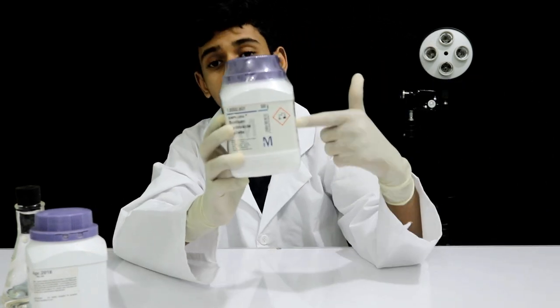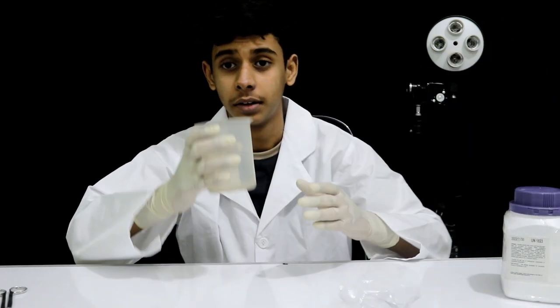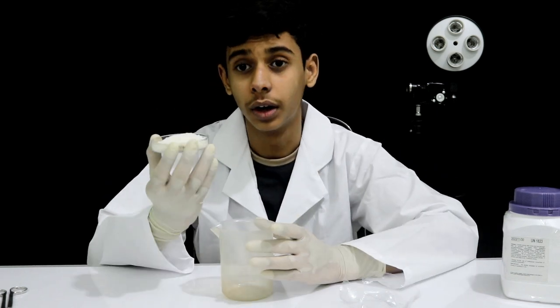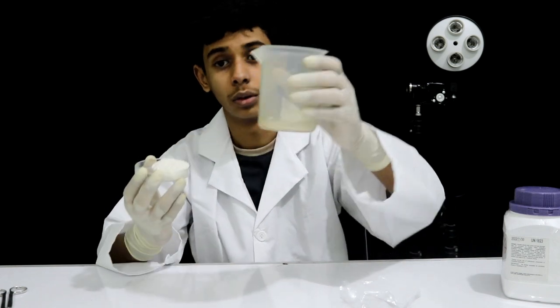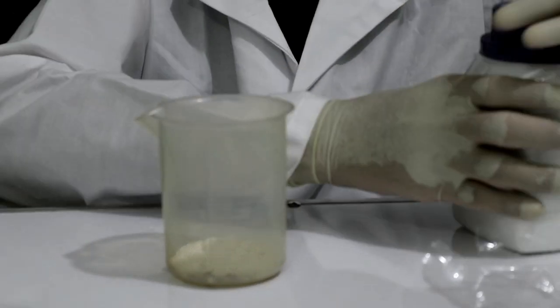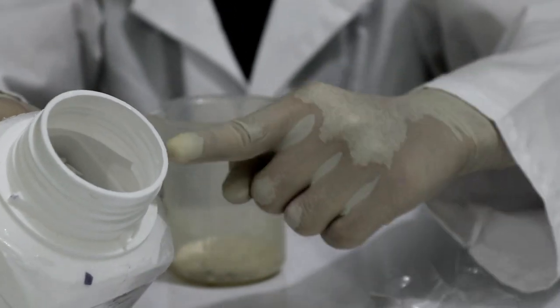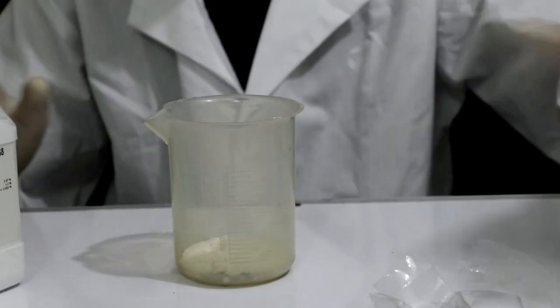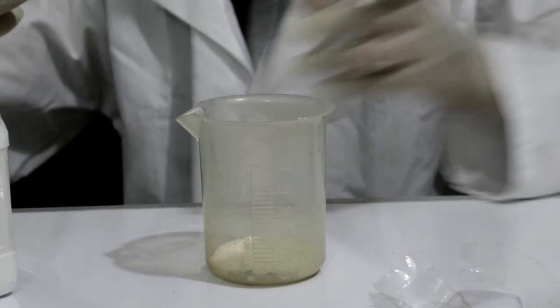This is the main chemical — sodium hydroxide. Let's go. First of all, we have 5 grams of blended sugar. Then 10 grams of sodium hydroxide. Let's add 10 grams of sodium hydroxide.